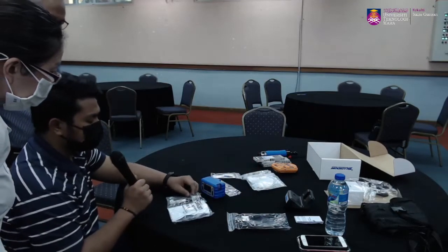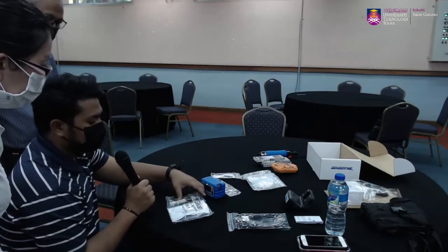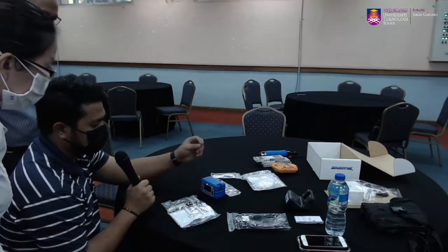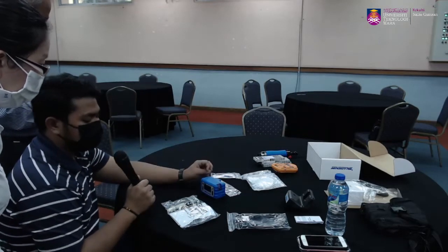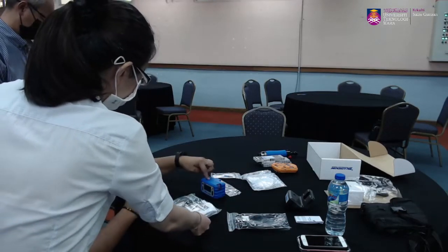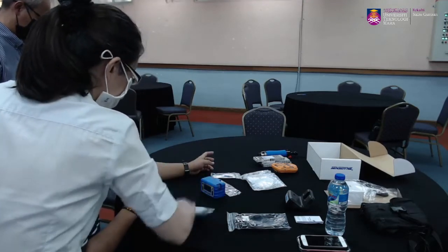So the cyclone is connected with our cassette. We take our cassette for dust. Usually we will use this cyclone. So we insert our cassette in between here and connect the opening at the top to the luer. And then connect the Tygon tubing to our pump. This one connects to the cassette, and the cassette is connected to this one, to the pump.